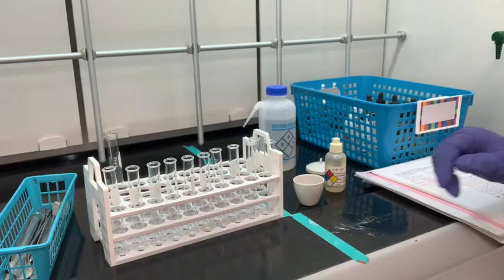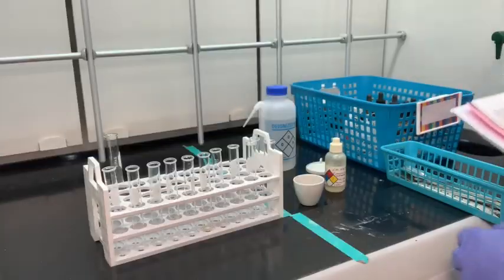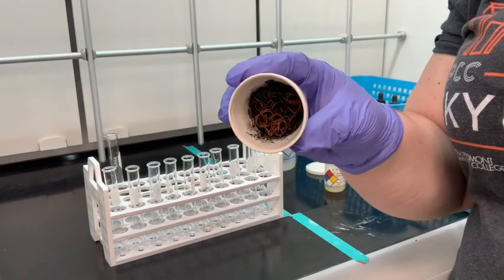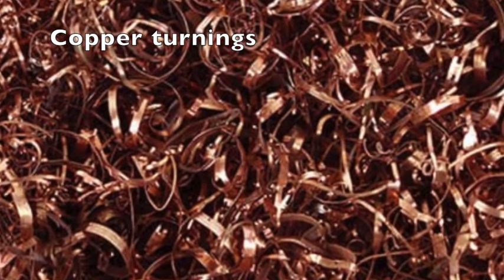I'm just going to use a spatula to break this up. There are a couple of questions you want to think about. Does this resemble copper? Remember, copper is kind of shiny. It was in ringlets.